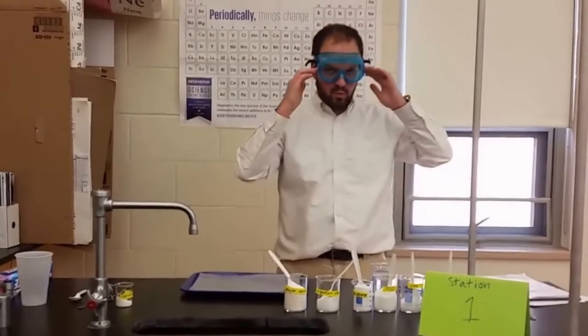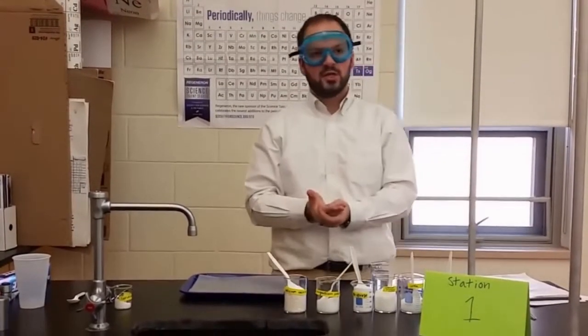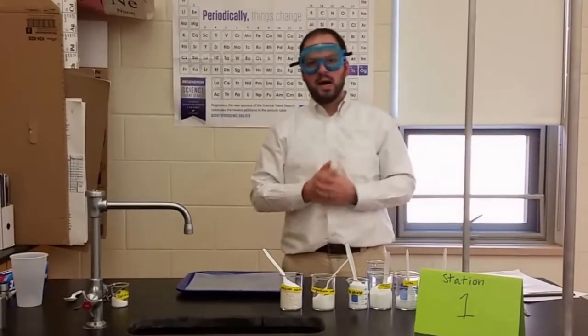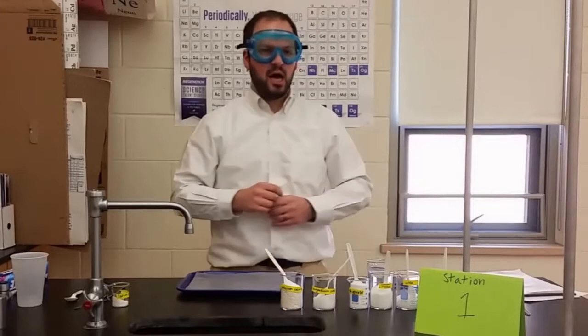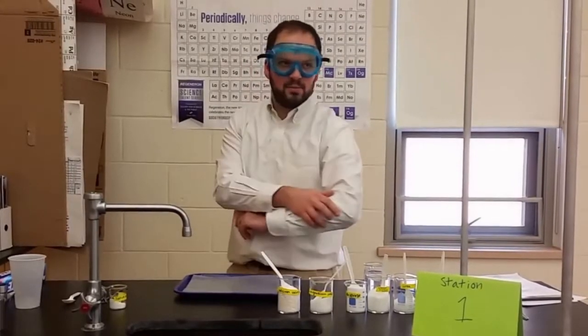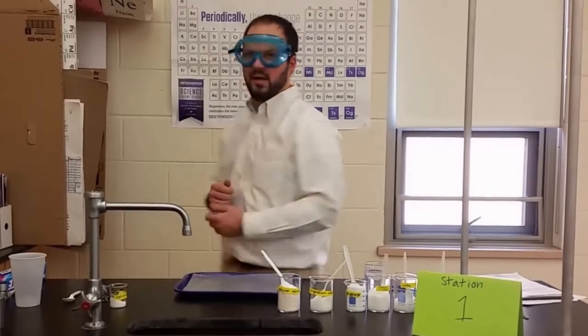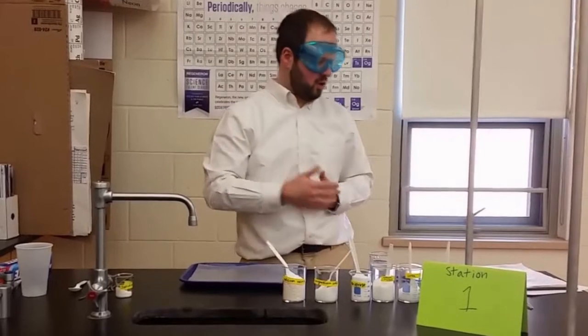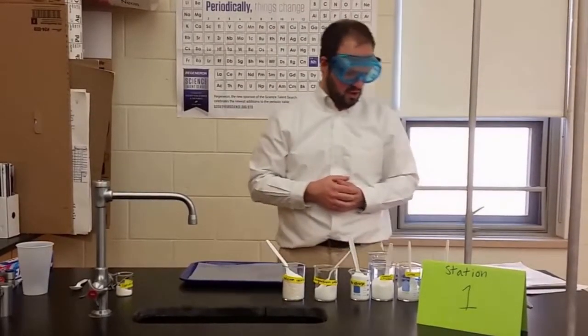For safety, you're going to want to wear goggles. If any chemicals get on your skin, you're going to want to wash that off right away and inform a teacher. There's going to be a hot plate at one of the stations. The hot plate is hot. Please be careful to give it a wide berth. Keep your arm away from it. Don't absentmindedly put your arm into it. Don't turn your back at it because you might get burned. Also keep in mind that it stays very hot for a very long time even after you turn it off.